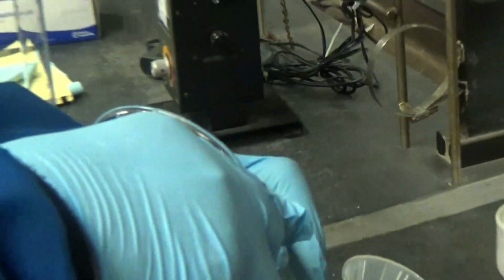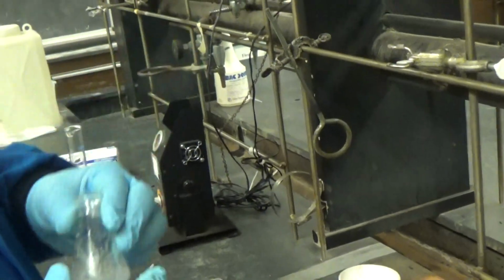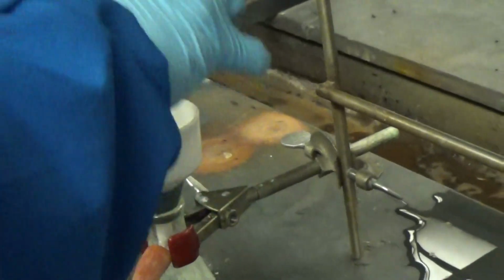You just add a little bit of water. Is that what you're doing? Ice water, I think, is better, because ethanol will dissolve it, unless it's cold ethanol. But yeah, this is fine.